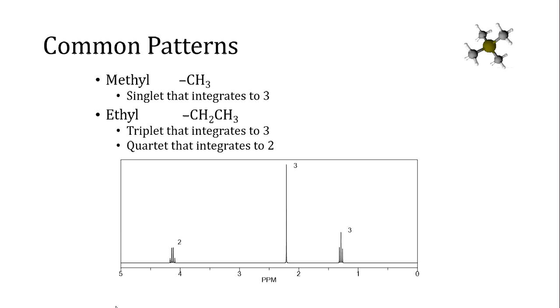And in this slide, you see that the integration numbers have been placed at the top of the peaks. Depending on the software that is being used, the integration numbers can show up in a variety of places. But usually they'll be above or below the peaks.